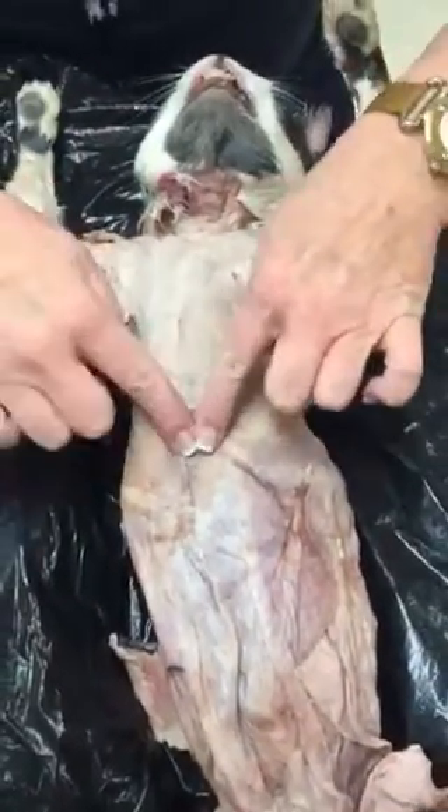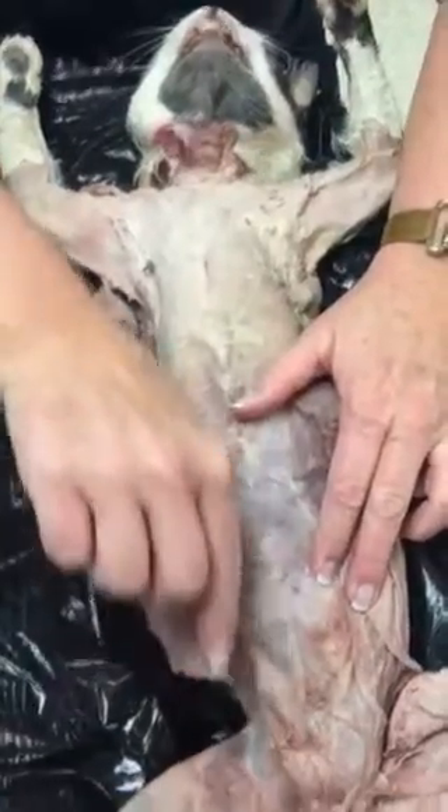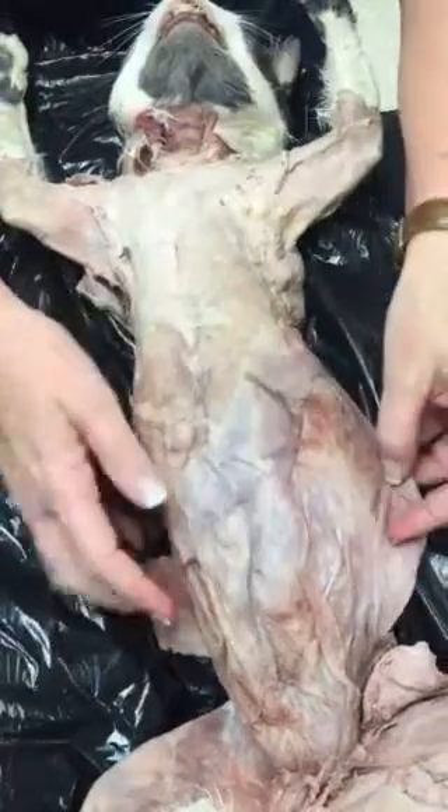When we turn it over, we're looking at the ventral surface. We have pectoralis. We have linea alba, rectus abdominis, and then we have the external obliques. Then we have internal oblique.